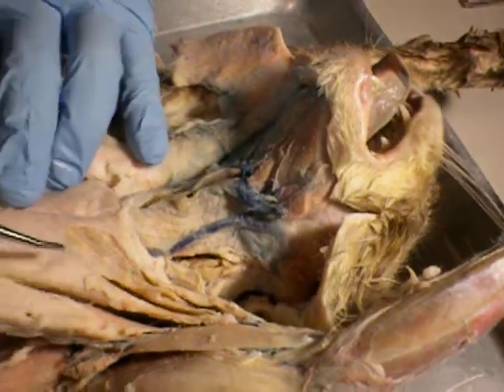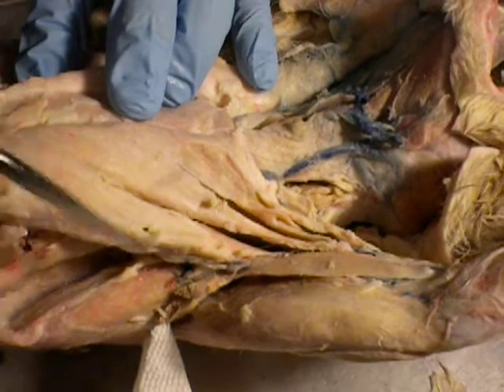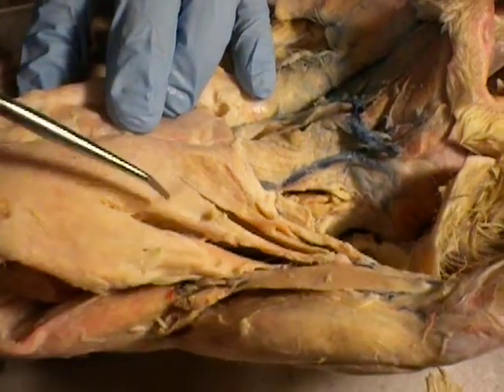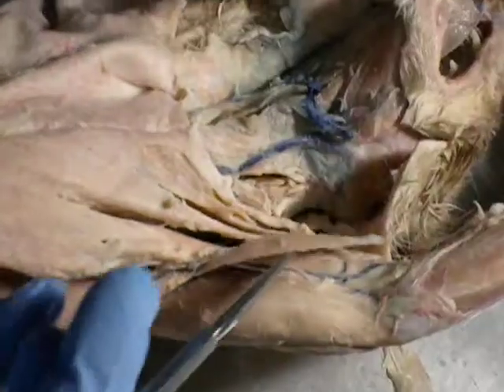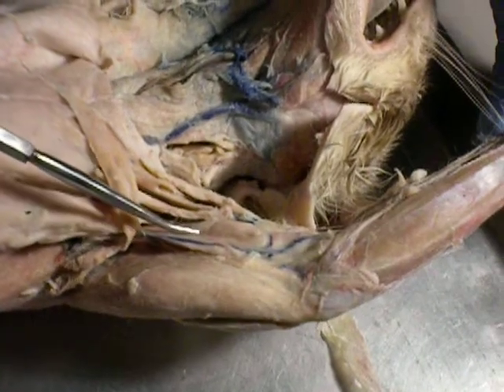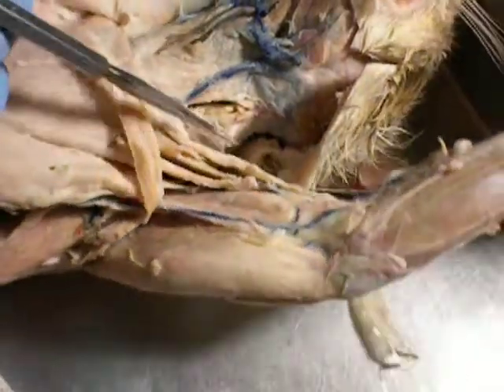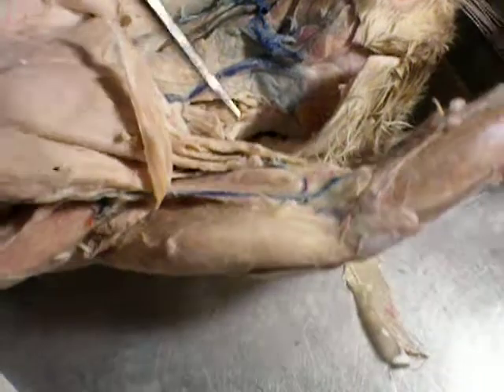We have pectoralis major, pectoralis minor, minor, major. On this side of the arm, biceps brachii, which is the flexor muscle. This is the clavobrachialis, which is connecting the arm to the shoulder.